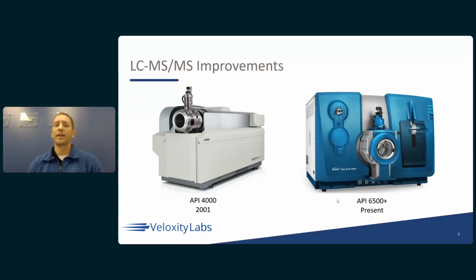And then also on the analytics side, I'm showing some pictures here of gold standard triple quad mass specs that are used in the pharmaceutical industry, from ABSciex. In the year 2001, the API 4000 debuted. Great instrument. It's a workhorse. And then now we have access to the 6500+, which has been significantly improved in the last 20 years. As you can see, the two biggest differences are that the 4000 utilizes linear quadrupoles and has a different source than the 6500.